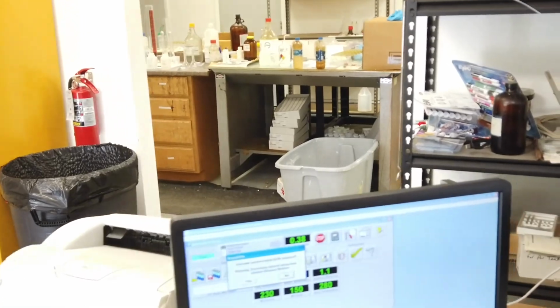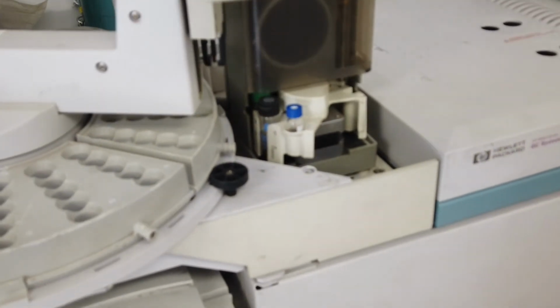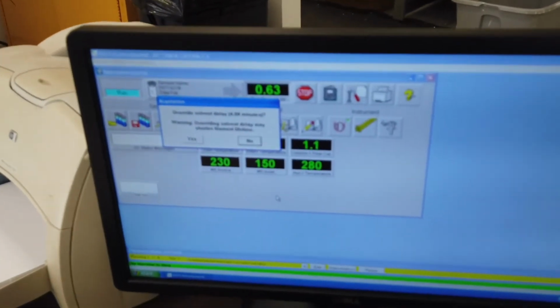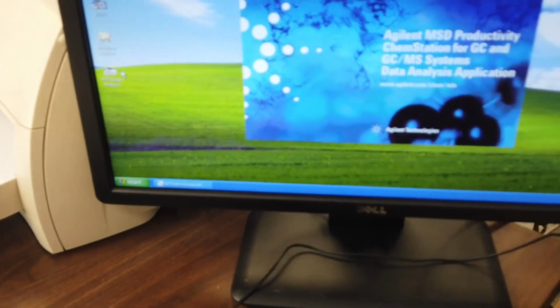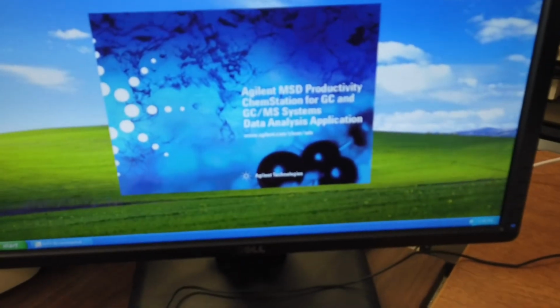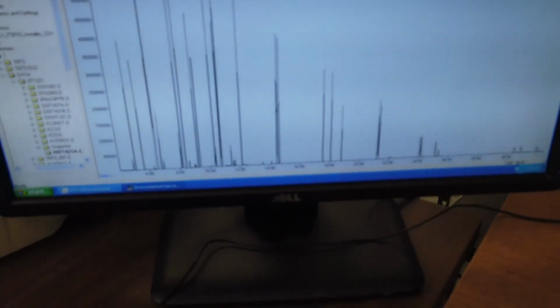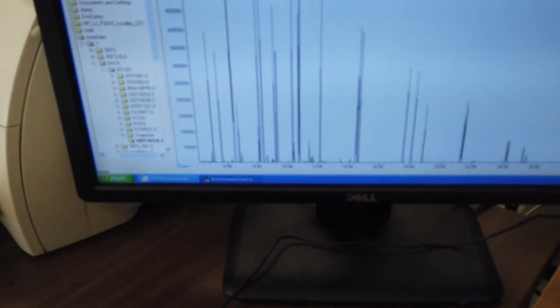Setting up, it's doing its first sequence. This is probably the fastest I ever set one of these up ever, and it's running really good. Look at that. That is gorgeous. Don't get any better than that. These are my PNA SIM method.